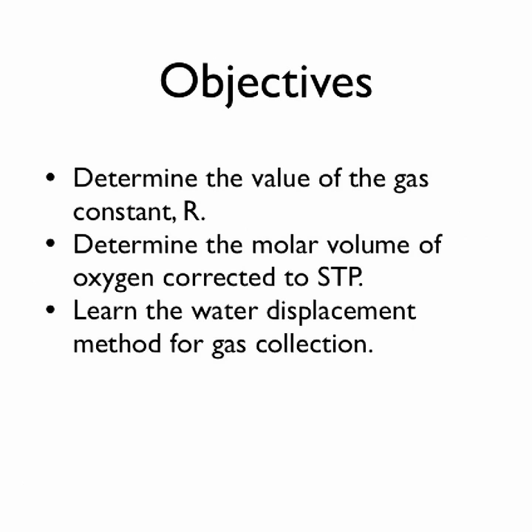First, we'll need for our procedure to prepare our sample. On a piece of weighing paper, weigh out between 0.9 and 1.1 grams of the potassium chlorate and 0.3 grams of manganese 4 oxide. Record these weights accurately on your report sheet. Flush any excess potassium chlorate down the drain. Manganese 4 oxide can be placed in the trash can.